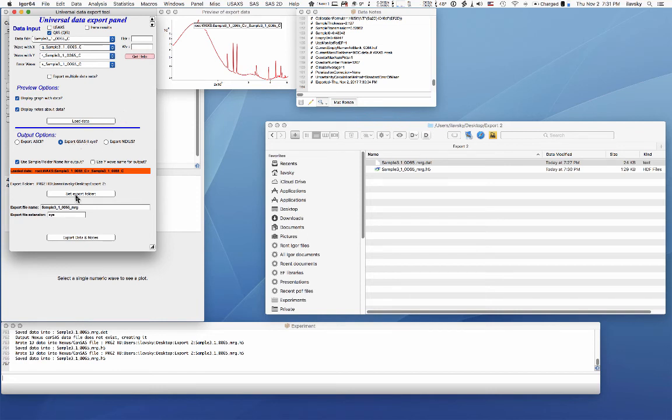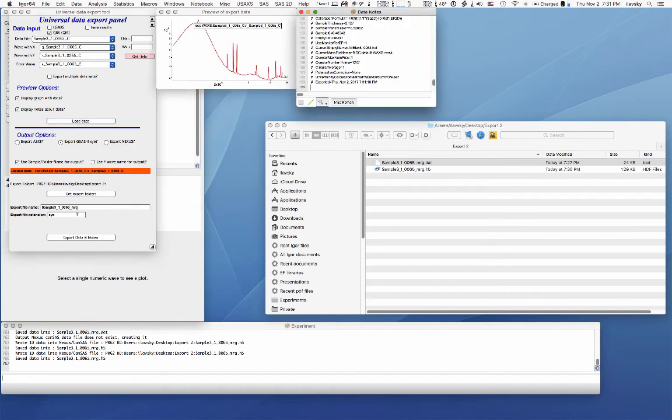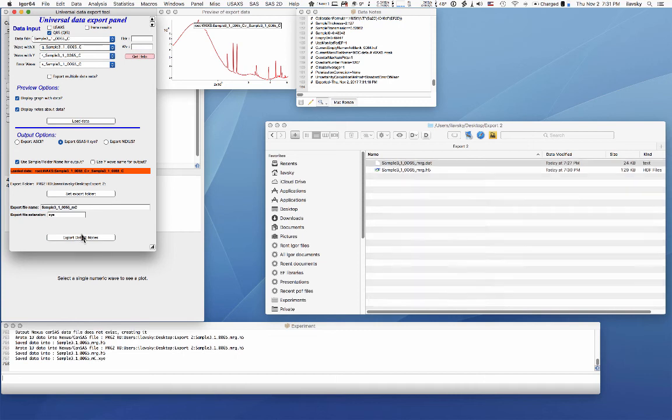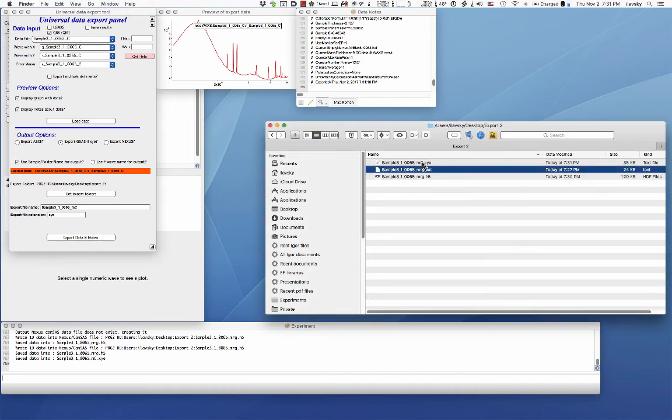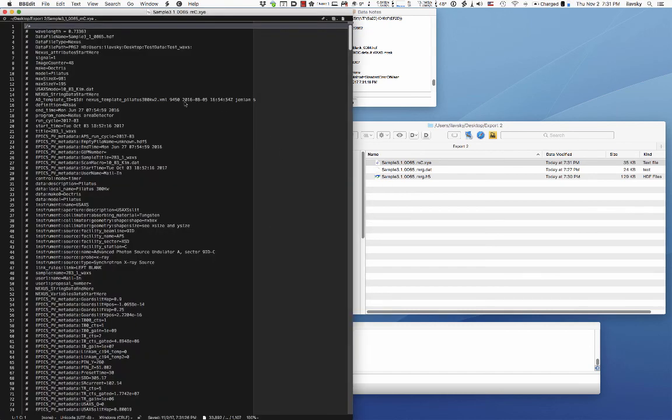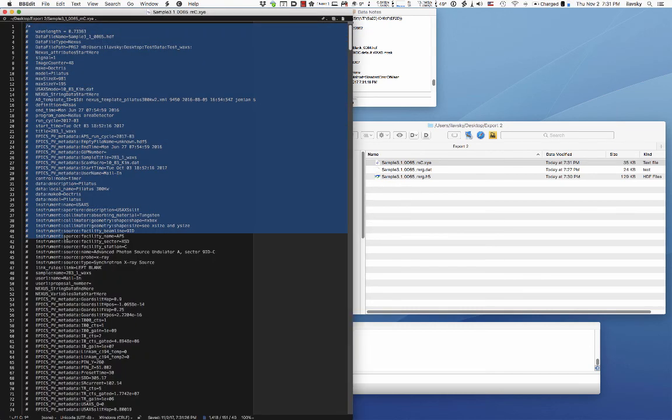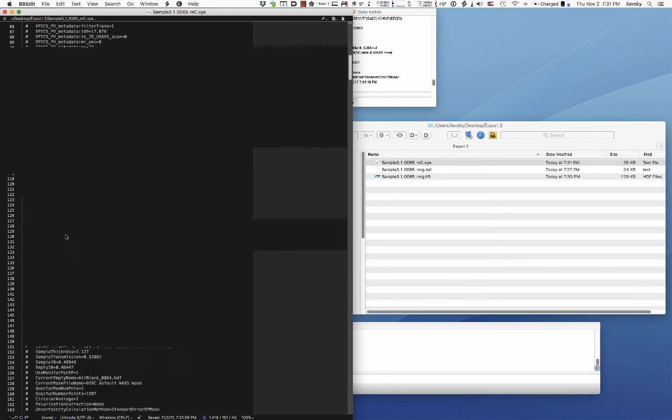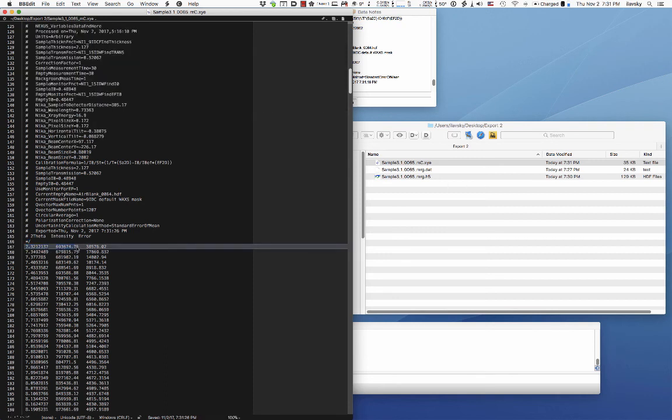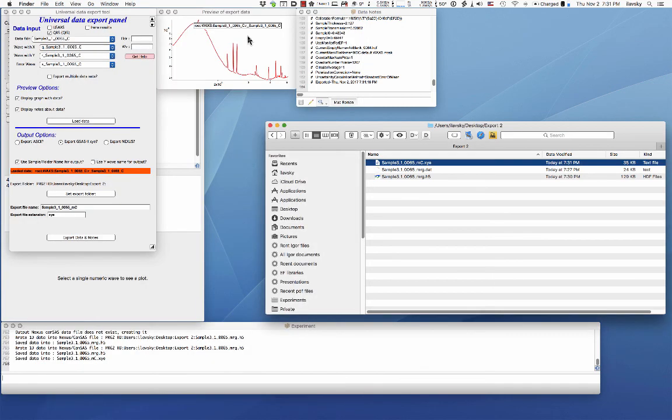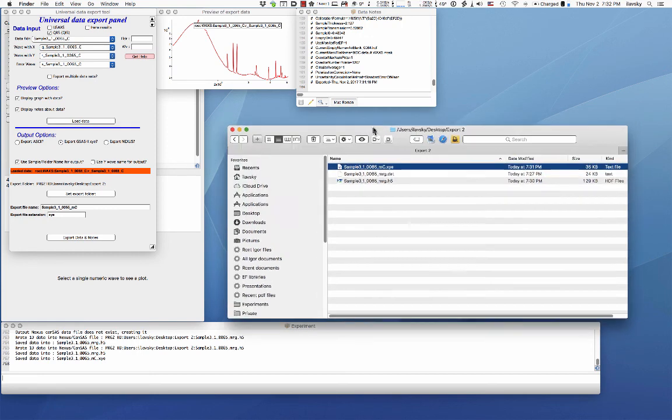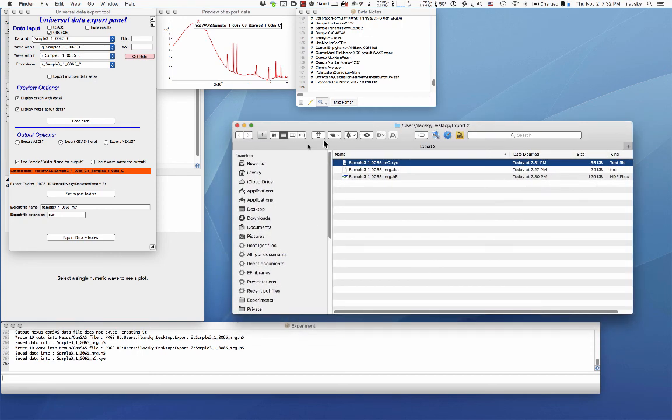And the XYE dataset will have a header, which is useful and ugly and big, but then at the end is going to have a column of two theta data, intensity and error. And so this we tested is readable in the GSAS-2 and very likely in lots of other programs because apparently the XYE data type is common for powder diffraction. And that's what I was told. I haven't tested anything else than GSAS-2.